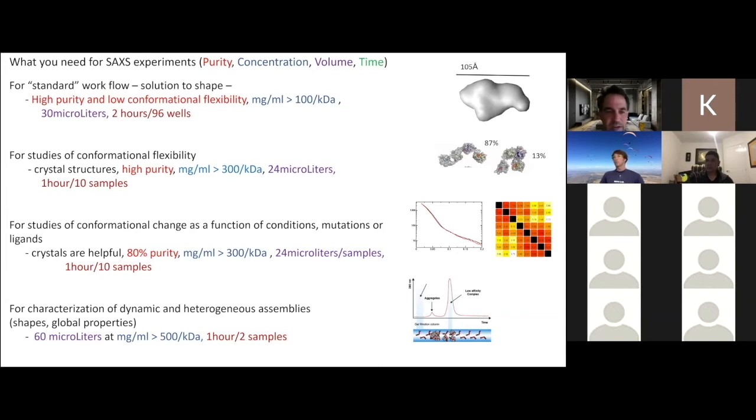So again, it's reciprocal. The low resolution information is highly weighted in the small q regime, that is, the longer distances are highly enriched in the small angle data, and then the more subtle conformational changes, fold stuff, is in the higher q. Although, of course, everything contributes to everything, but that's sort of an enrichment.